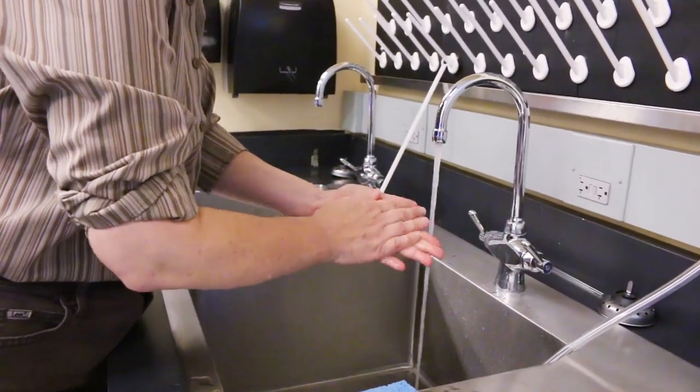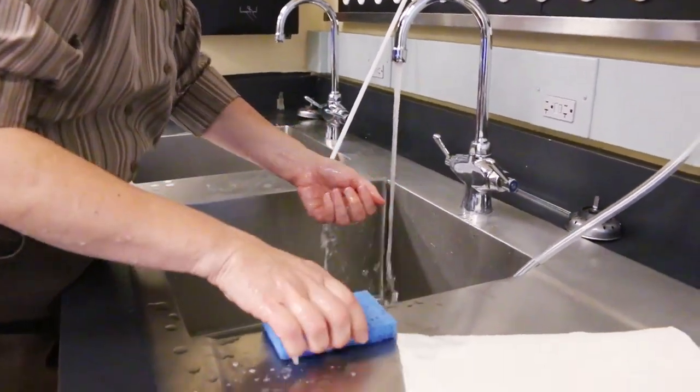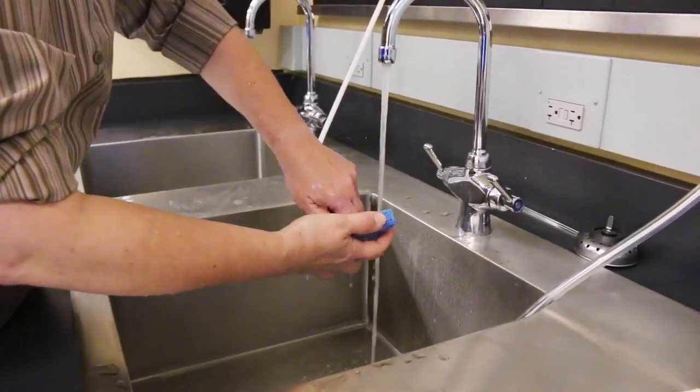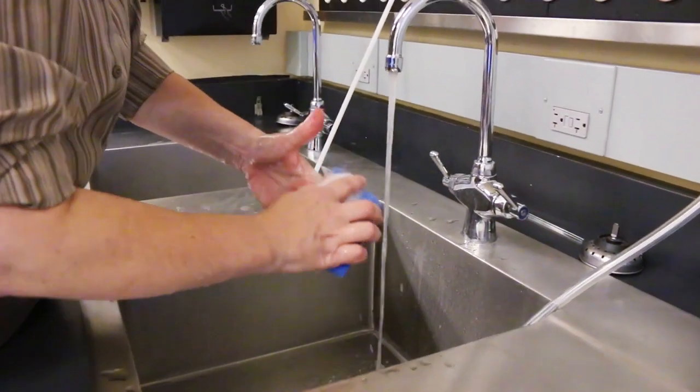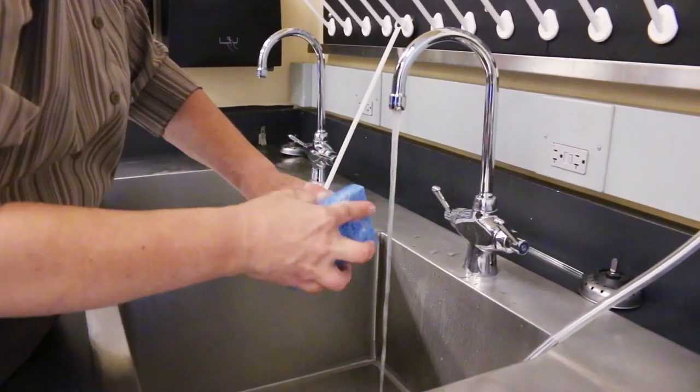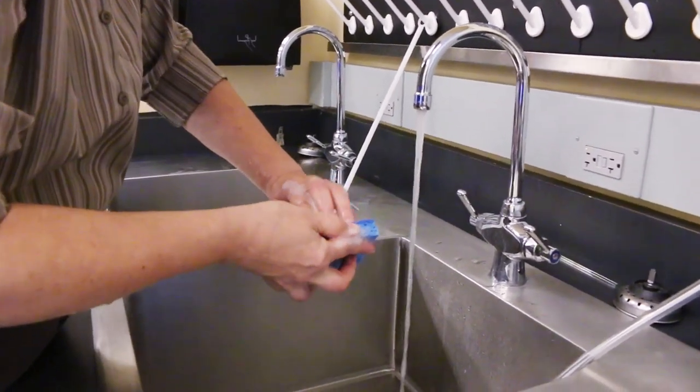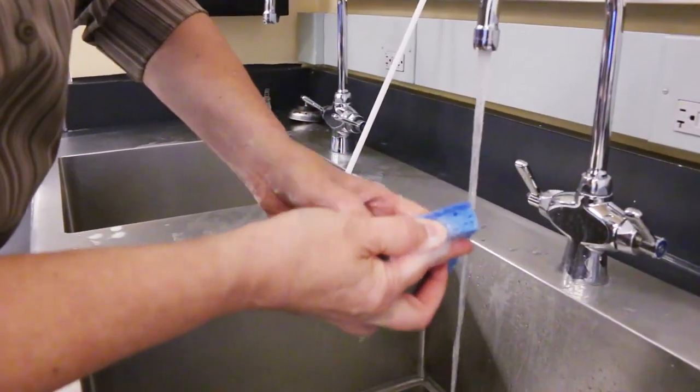Apply a small amount of water to the scrub sponge or brush. Step 12, using the brush side of the sterile scrub sponge, use that under your fingernails of your left hand moving from thumb to pinky and repeat on the other hand.